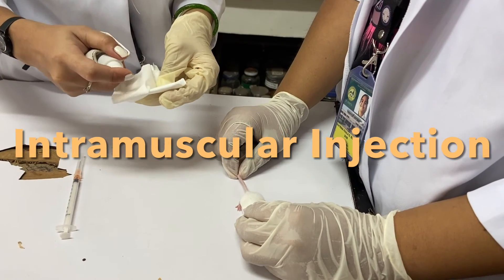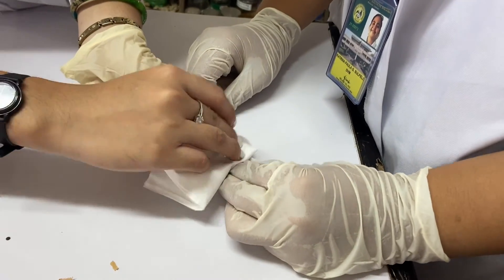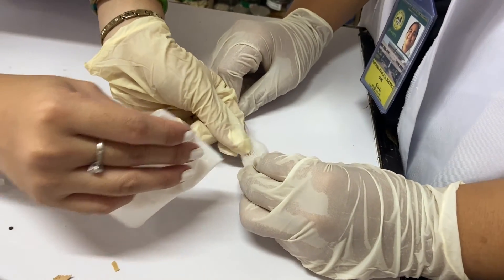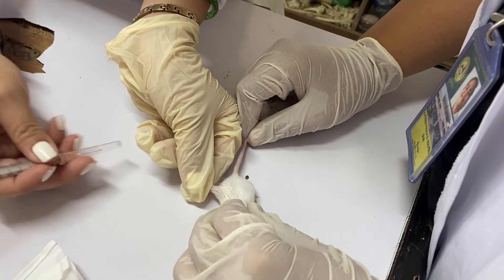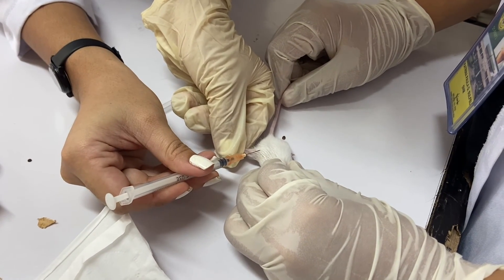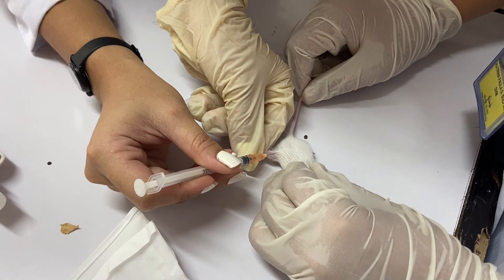Intramuscular injection: restrain the mouse with the help of an assistant. Extend the hind limb. Disinfect the thigh muscles, which are a large group of muscles exteriorly located, with sterile cotton and alcohol. Insert the sterile needle into the thigh muscles. Be careful not to insert the needle too deeply because of the risk of hitting the sciatic nerve.